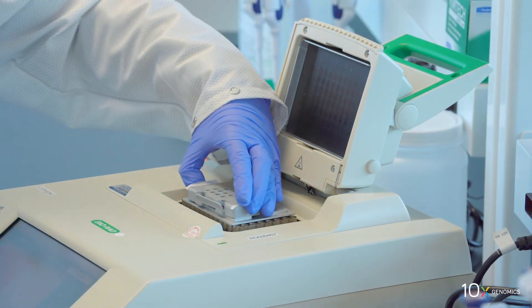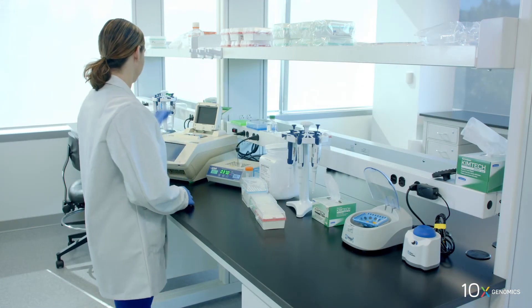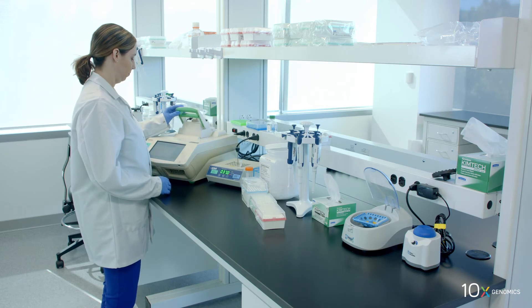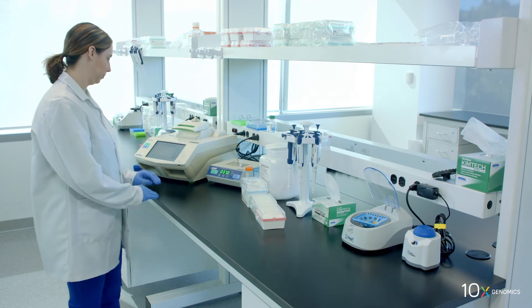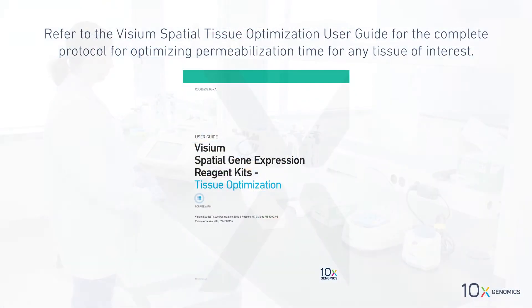Close the thermocycler lid and incubate for the predetermined permeabilization time, which is tissue type specific. Refer to the Visium Spatial Tissue Optimization User Guide for the complete protocol for optimizing permeabilization time for any tissue of interest.